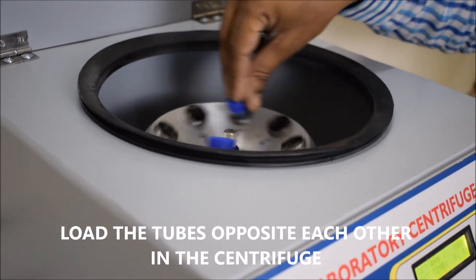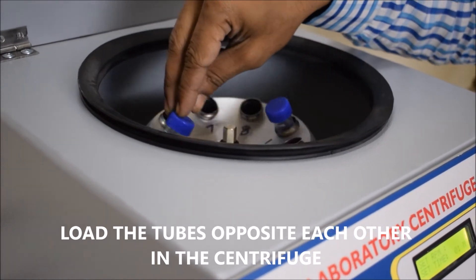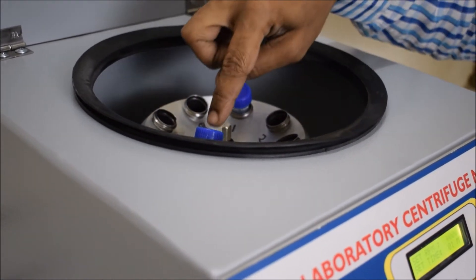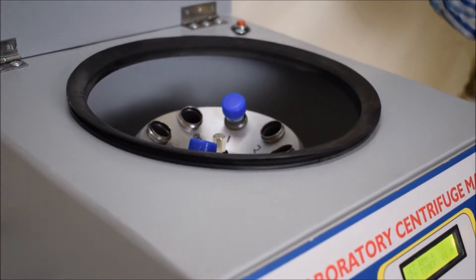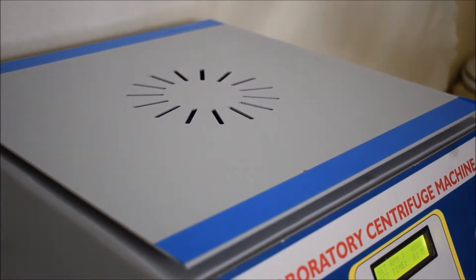If you are only spinning one sample, you will need to make a balanced tube to load directly opposite the sample tube. If you are spinning more than two tubes, only the ones directly opposite each other have to be in equal mass.